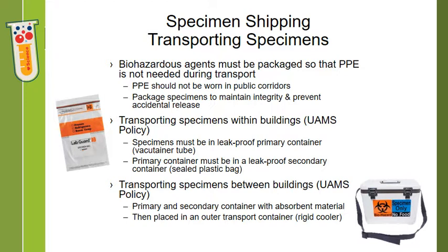When shipping or transporting biohazardous agents — also called infectious substances — these must be packaged so that PPE is not required during transport. PPE shouldn't be worn in public corridors in your facility. Make sure you're not carrying blood tubes across campus with your gloves on. These packages must also be packed in a way that will maintain the integrity of the specimen and prevent accidental release — you don't want the specimen to be accidentally dropped and the tube pops open with blood everywhere.